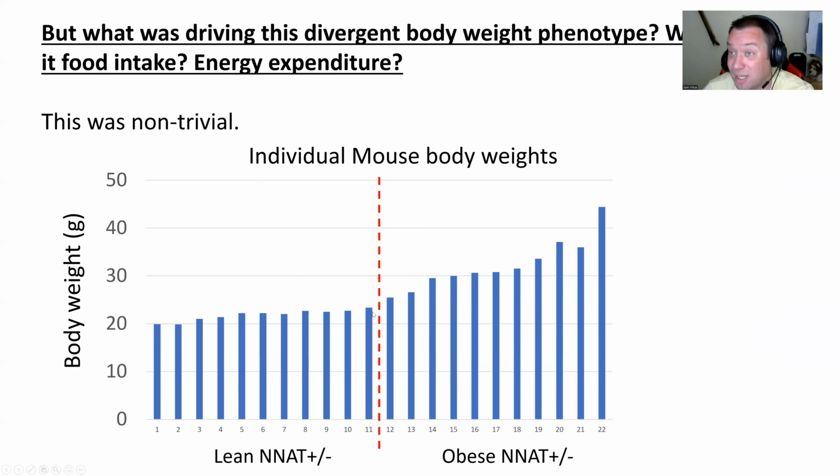What we actually ended up doing was putting this data through things like PCA, using as many variables as possible, to see where they split out as groups. We tried k-means clustering, and we also split at 50% body weight, and they all gave the same result on females. A little bit different on males, but on females, everyone said this is where to cut your line.